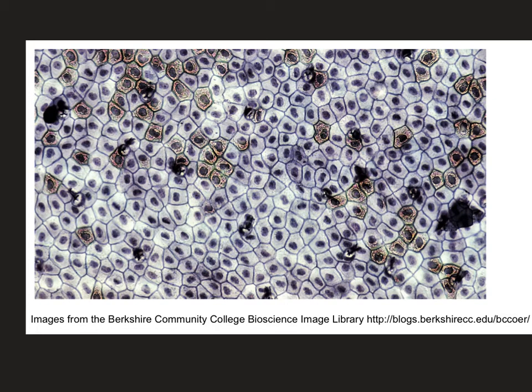Cells are usually fairly easy to spot because they are distinctly shaped and they have nuclei. Nuclei are almost always stained. In this image you can see that there are a lot of cells. Each of these little oddly shaped pieces is its own cell and inside of it has a single nucleus. The cells are all right next to each other, touching, and there's not a whole lot of other extraneous tissue surrounding this particular cell structure.